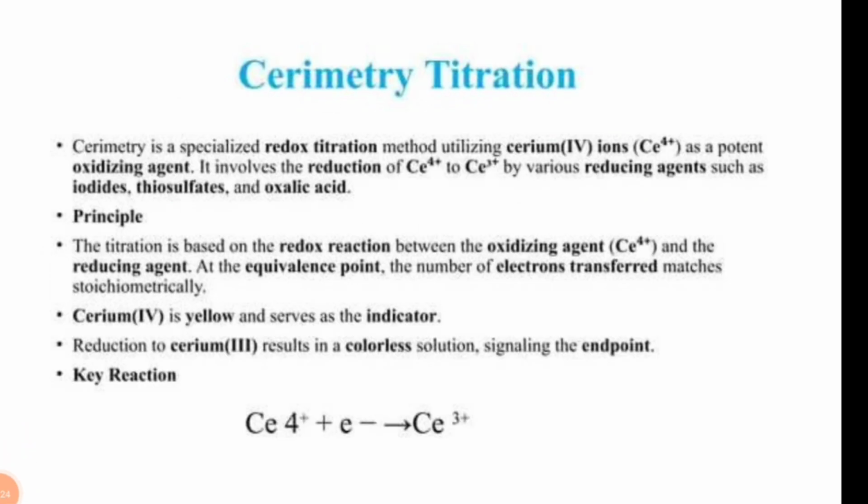Next is cerimetry titration. Cerimetry is a specialized redox titration utilizing cerium ion Ce4 plus as a potent oxidizing agent. It involves the reduction of Ce4 plus to Ce3 plus by various reducing agents such as iodide, thiosulfate, and oxalic acid. Principle.